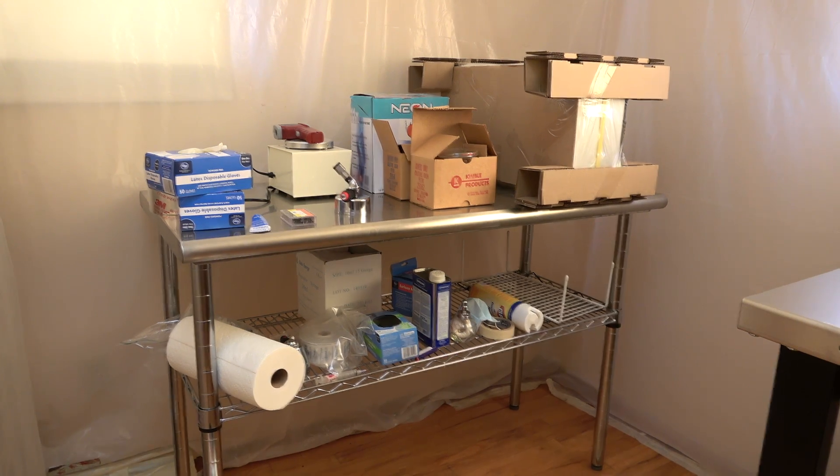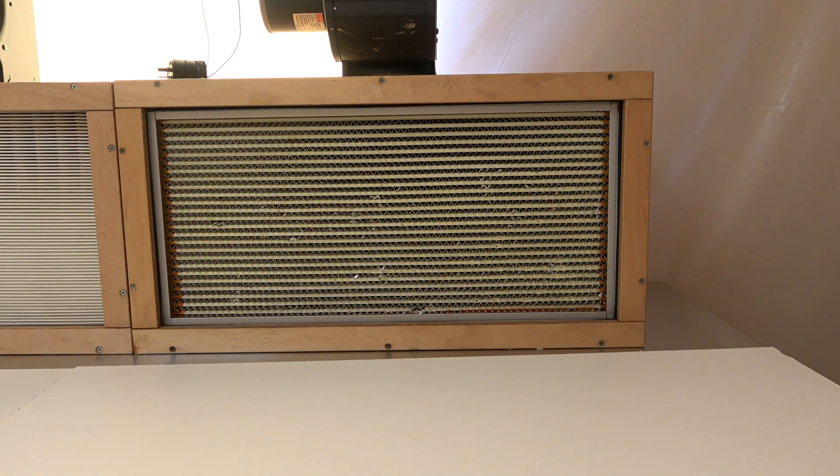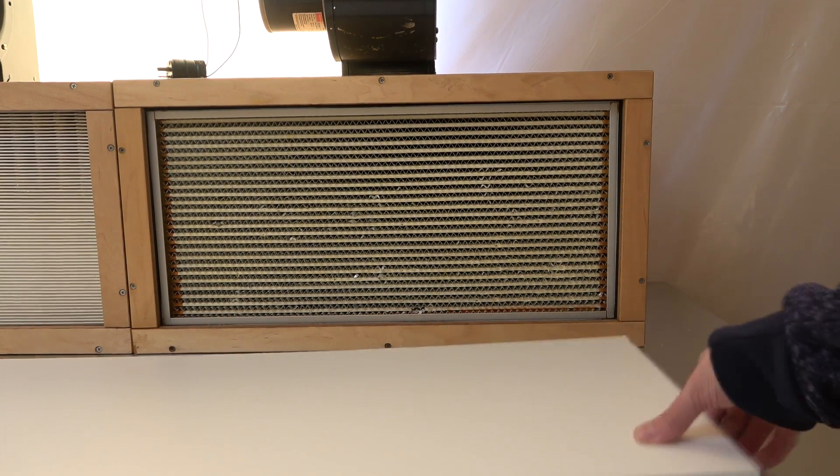This flow hood right here I've had for over 10 years. It's the SR1 model from fungi.com — pretty much the entry-level flow hood that a lot of people getting into mushroom cultivation choose. But the filter is old and I'm sure it doesn't give as good airflow as it used to, and it definitely doesn't give as much airflow as the new pleated filters. I have a new filter for it — they're very thick, about almost eight inches. I'll be making a video of switching that out, but for the moment I'm going to leave that.